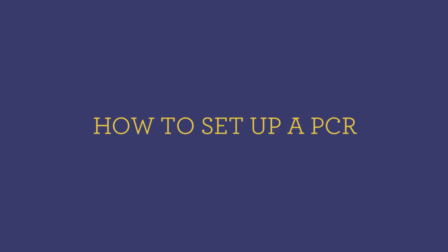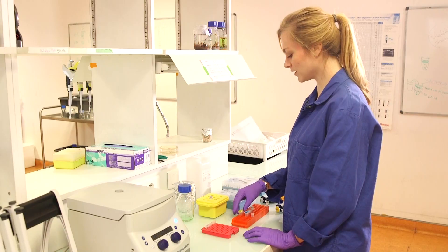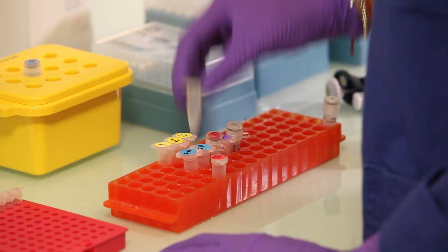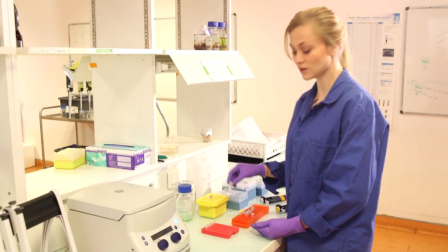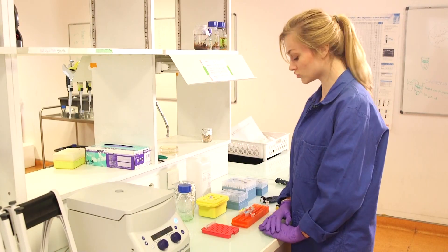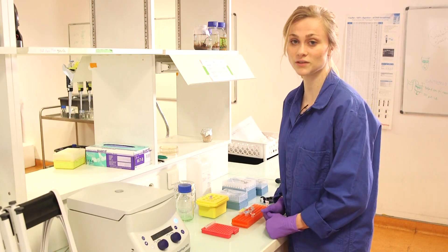Hello, welcome back to Synthetic Biology 1. Right now we want to show you how to do a standard type of DNA PCR that you can use in various situations. Here I have my three tubes with purified plasmids — plasmid 1, 2, and 3 — and a positive control plasmid. This is a plasmid I've previously used in a PCR reaction with the same primers and it worked really well. So if this one doesn't work, I know something is wrong with my PCR.